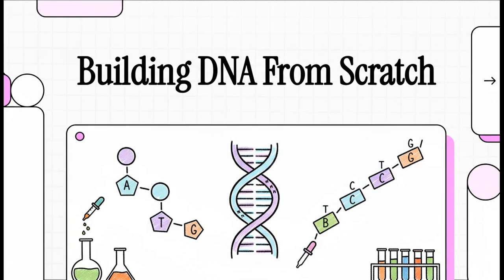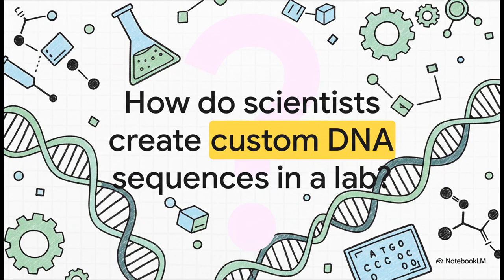Let's talk about something that is, without a doubt, a cornerstone of modern biology: building DNA from scratch. I mean, literally creating custom DNA molecules letter by letter in a lab. This is the chemistry that makes things like CRISPR, rapid disease testing, and even RNA vaccines possible. So, have you ever really stopped and wondered how that actually works?